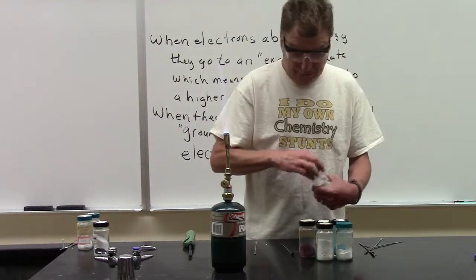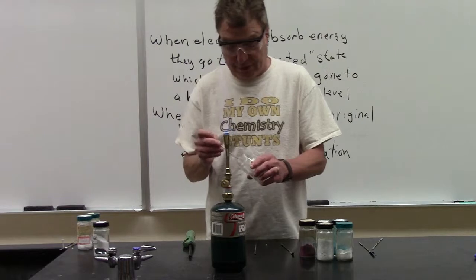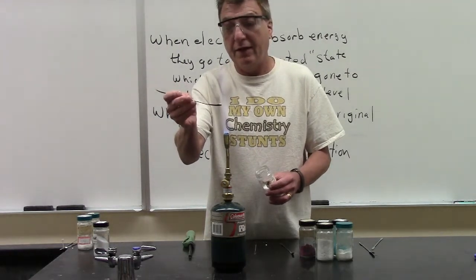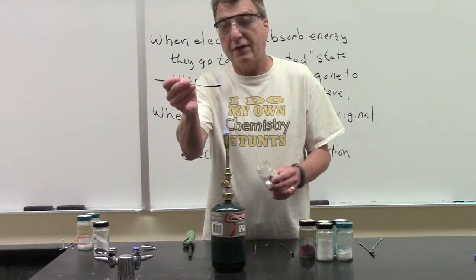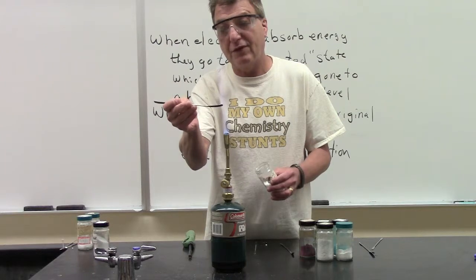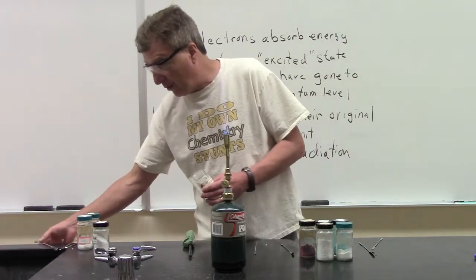Let's take a look at its close relative, potassium chloride. This would be sodium-free salt. You can buy this at any grocery store. Okay, and if you look carefully, it's a little hard to see, but it gives off a purplish color. Let me get it going here. Look at the side right next to where my flame is. It's kind of purplish. There we go. That's potassium chloride.